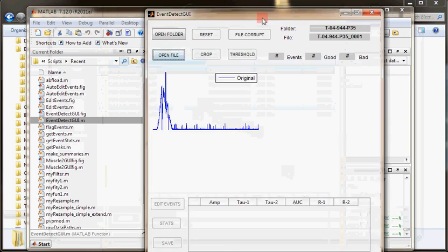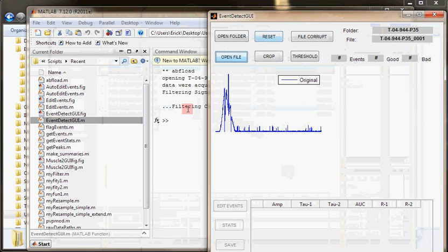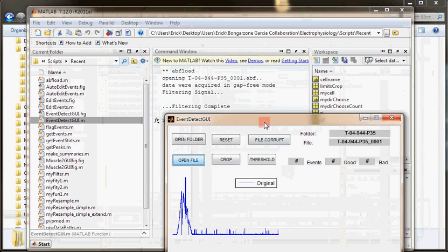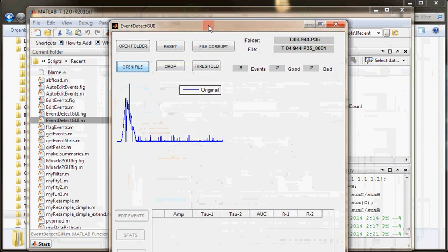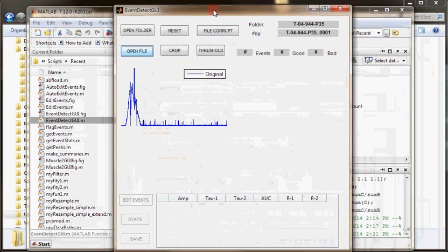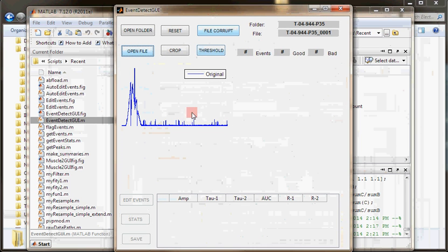It'll be thinking for a little bit while it's filtering. It filtered the data and plotted it. So now here is the data we want.